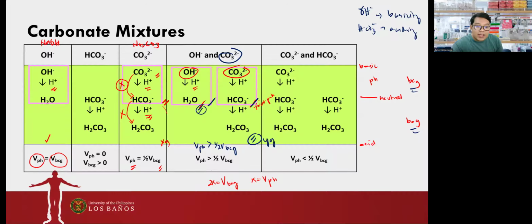So since mas mataas yung VPH, mas marami na sa basic component, so malamang OH minus yung merong kasama si sodium carbonate. So ang ating sample, most probably, by means of qualitative determination of the components, malamang NaOH at saka sodium carbonate yun.